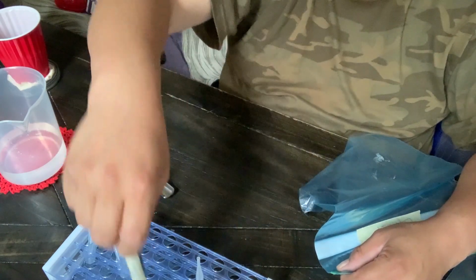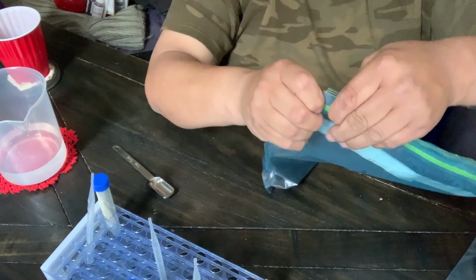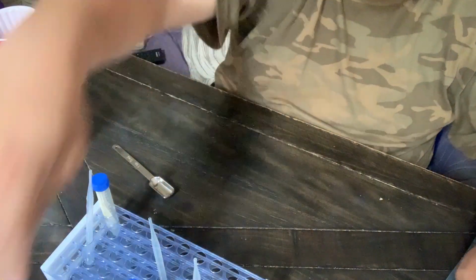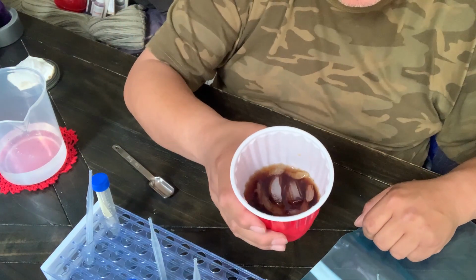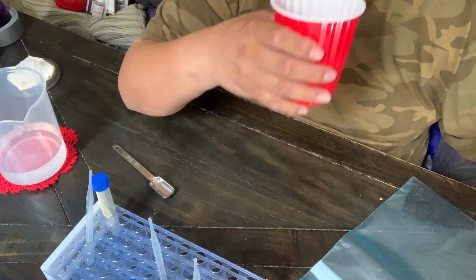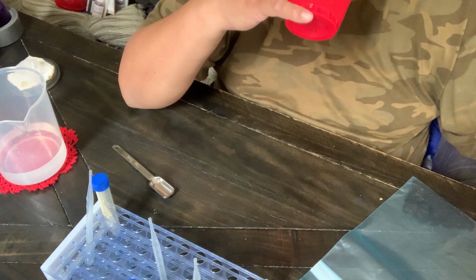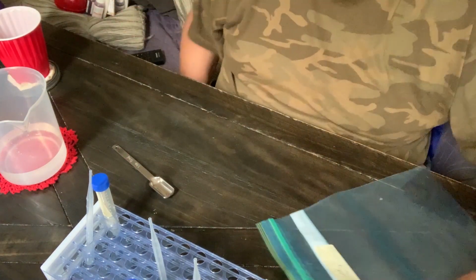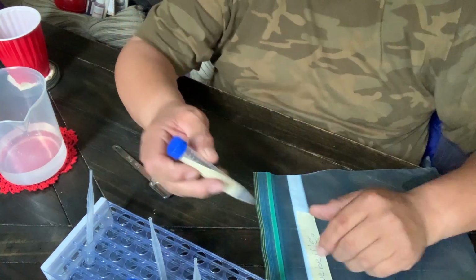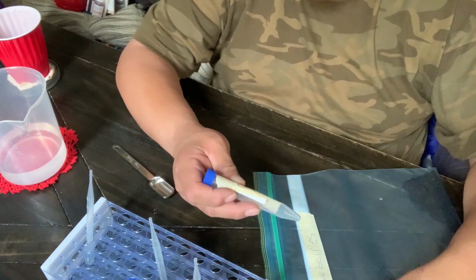All right, so let's put that one back here. Pipette. Seal that up. And then we got to take some of this stuff. This is for the operator. You got to stay refreshed. All right, so let's get our last one.